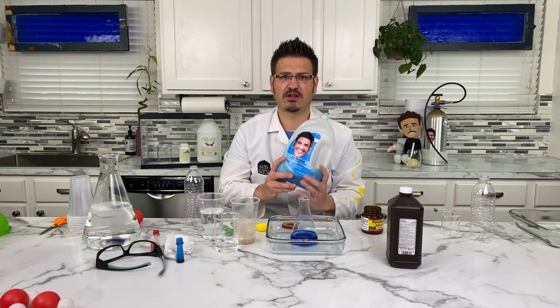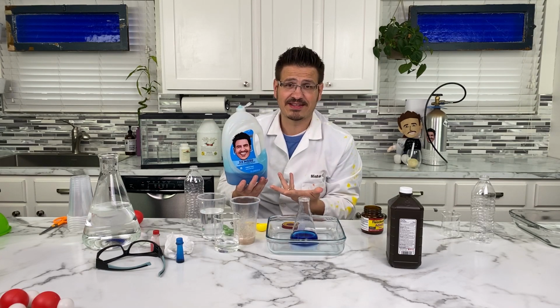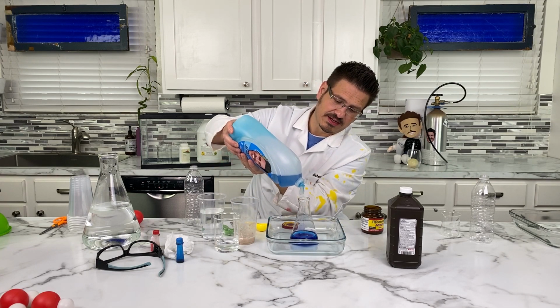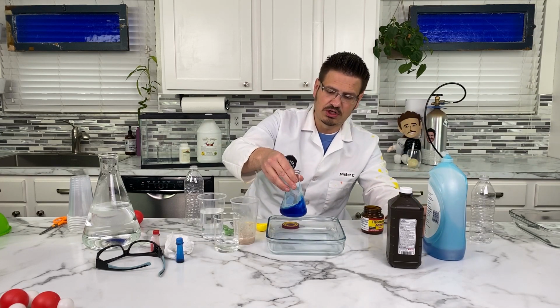All right, so I also have a little bit of soap. Now you don't have to have the Mr. C brand to make this work, but it definitely helps. It's a hair-raising experience if you use the Mr. C brand. But if you use regular dish soap, perfectly fine. You're going to pour a little bit of dish soap in here. We'll talk about why afterwards. Shake it up.